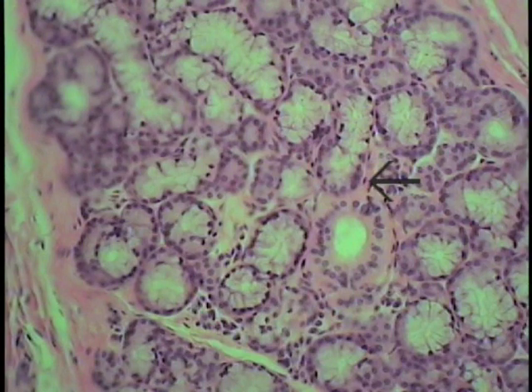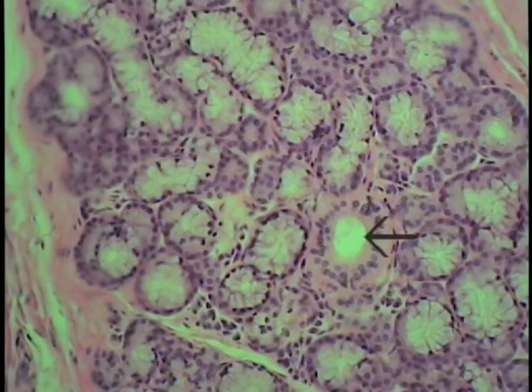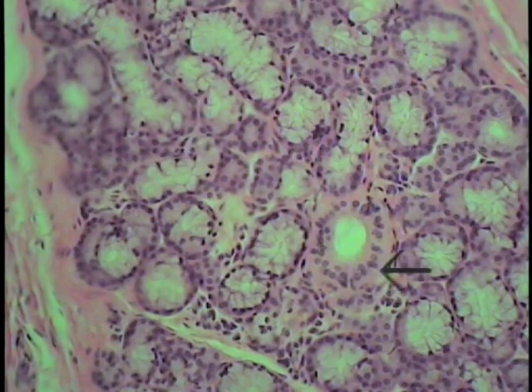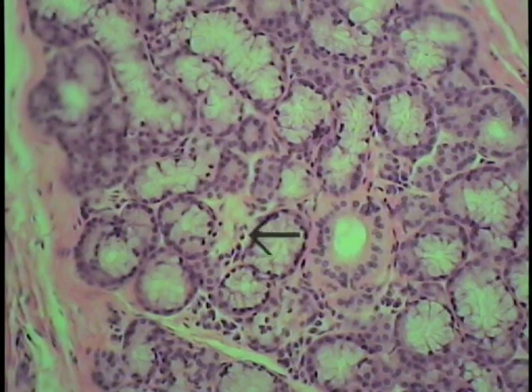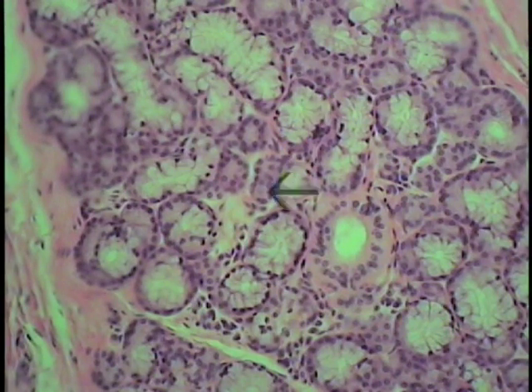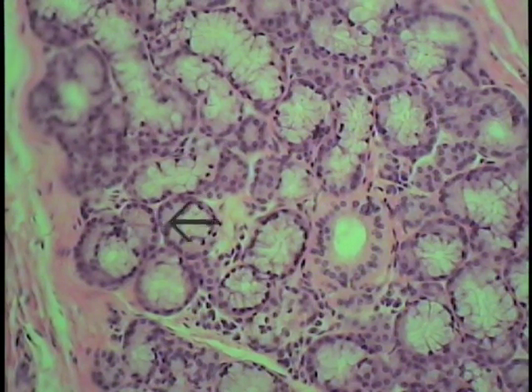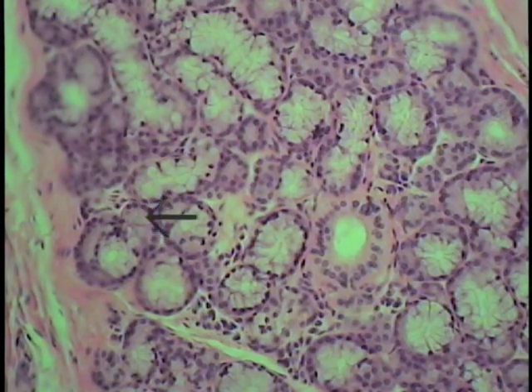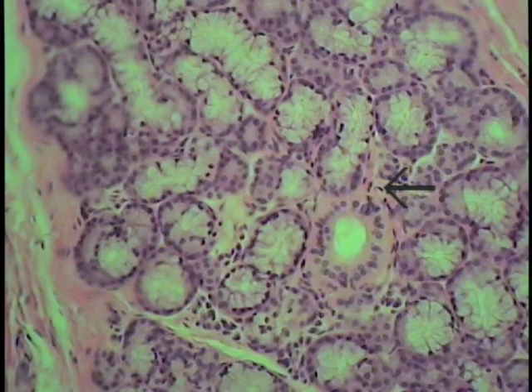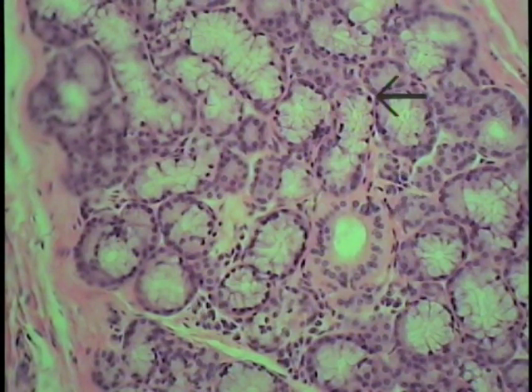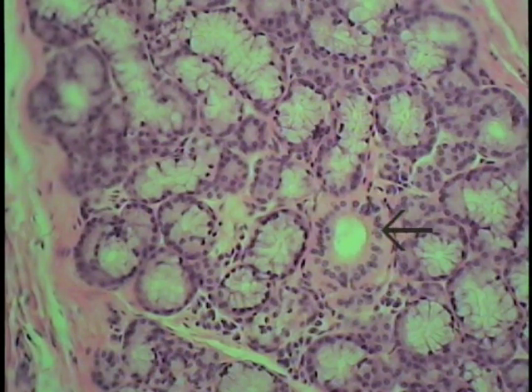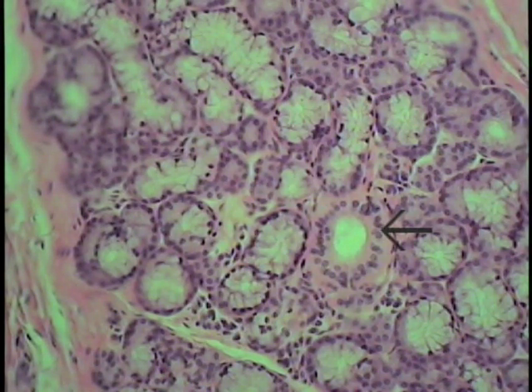At increased magnification, one of the labial minor salivary glands confirms the structural details: a compound tubular alveolar type of mixed gland. Shown in the field are a larger intralobular duct, mucous tubules, and serous tubules with serous demilunes. These minor salivary glands, as well as most glands in the cheek — the buccal area — are mixed compound tubular acinar type glands with both cell types and an elaborate inter- and intralobular duct system.